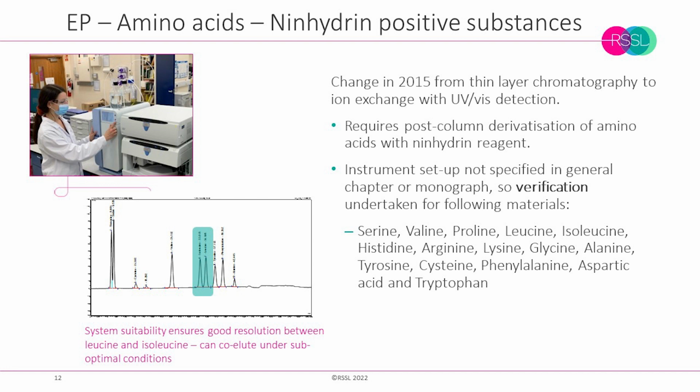Quantification is then achieved by visible absorbance detection, and the method provides more certainty in the analytical results compared to TLC, which can be subjective and can lack the required sensitivity.